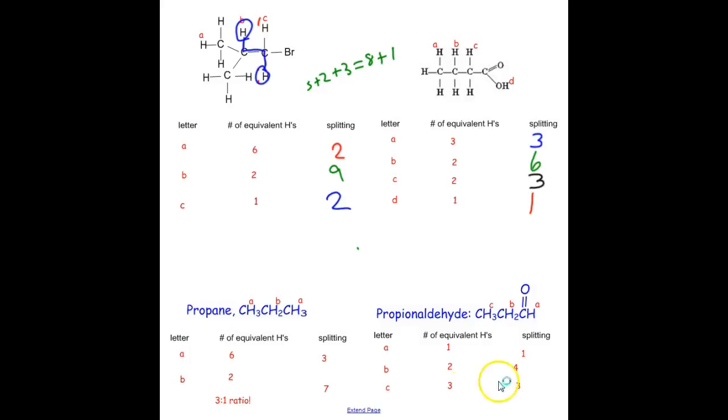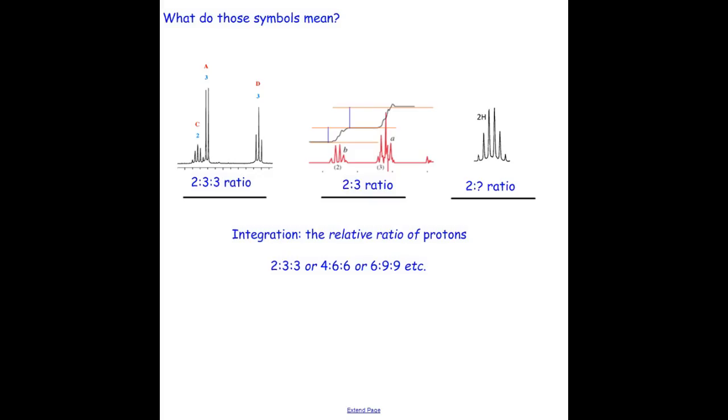Okay, let's take a look at what we've got. This one is surrounded by a CH3 and a CH3, so it will be split into 7. And this one has 2 near neighbors, so it's split into 3. All right, last little bit.